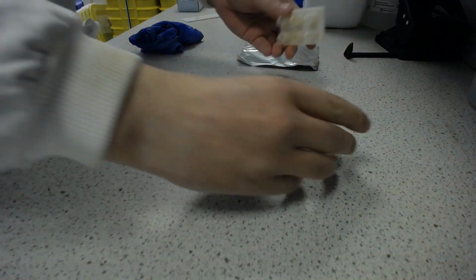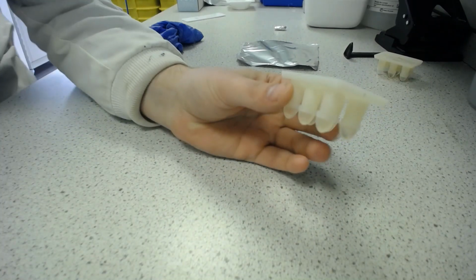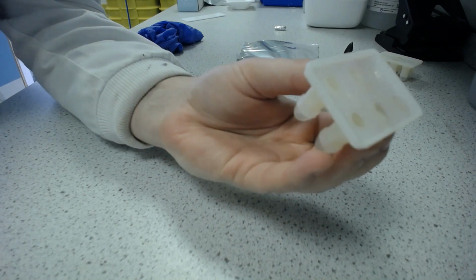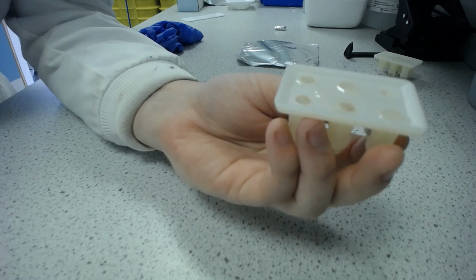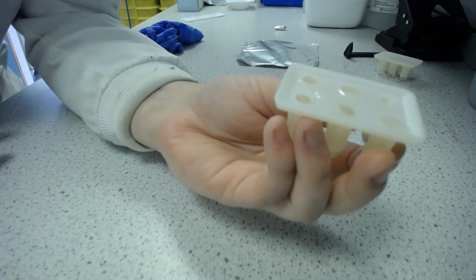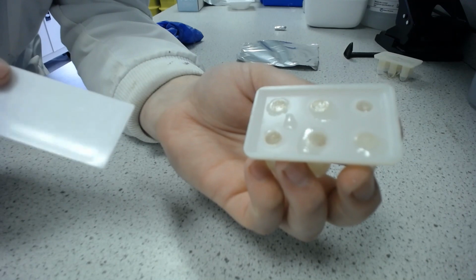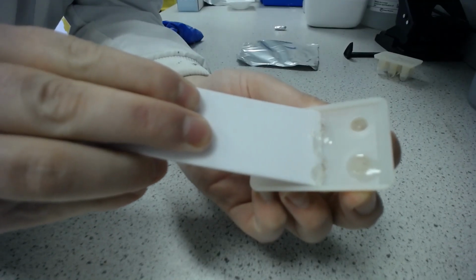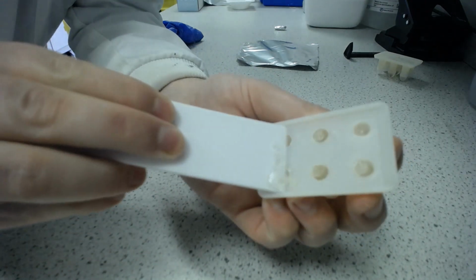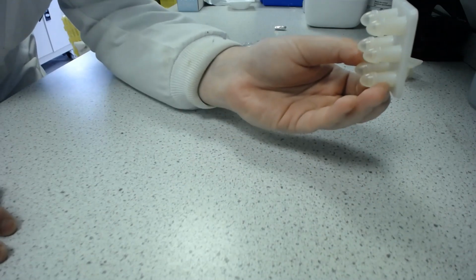There we go. So we've ended up with a full mould of 6 suppositories, like so. And you can see on the top we've got a little bit of excess where I over poured some of the moulds. So the first thing we're going to do is scrape that off to make them appear even, to give them an even dose, and to make them easier to take out of the mould. And the way we're going to do that is by using a scraper, nothing fancy, just a plastic scraper, and we put the flat side down and push across, like so. Maybe do that a couple of times just to get everything off. Perfect. So now we've got even suppositories in a suppository mould.